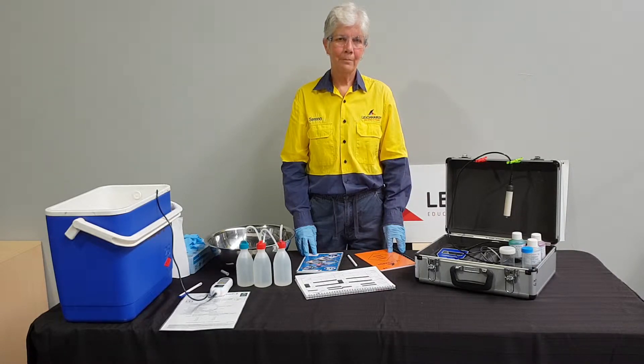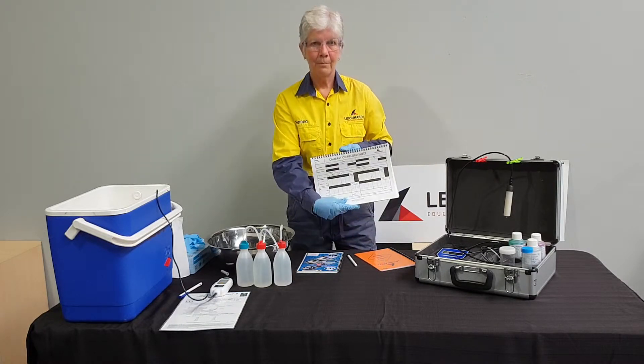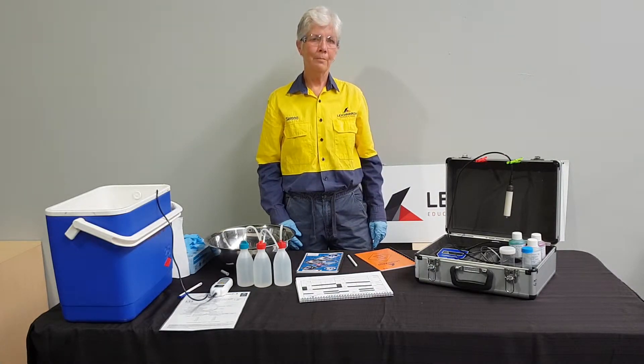For quality assurance purposes we always complete a calibration record sheet whenever the instrument is calibrated. Calibration is a process we follow to ensure our equipment is measuring accurately.